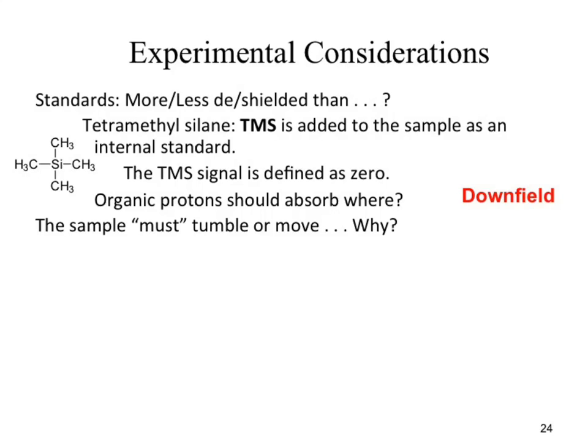The instrument now thinks, oh, that's a different structure, I'm now looking at the back of the structure. It doesn't have the processing ability to see that. So our molecule has to freely tumble and move. This allows us to average out those weird inconsistencies with the structure, chair flips, right? So that we get a nice clean signal out of this.